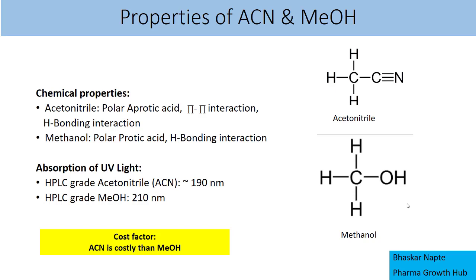Another important factor is the cost of methanol and ACN. Here, ACN is costlier than methanol. So whenever there is a possibility of using methanol over ACN, you must prefer methanol to save cost for your laboratory.